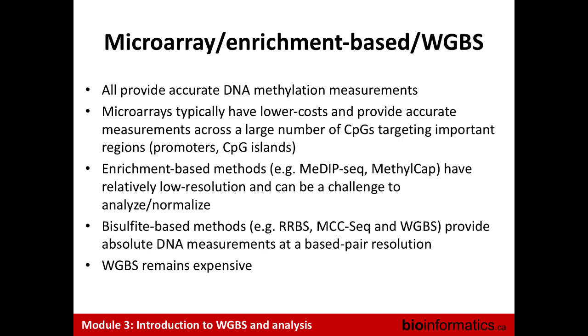The last two points: these sequencing-based approaches provide absolute DNA methylation measurements at base pair resolution, which is great, but the cost can still be a bit expensive.